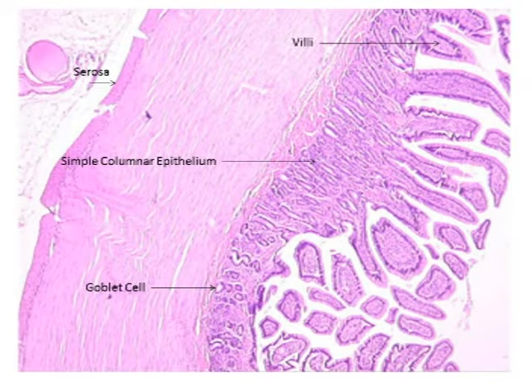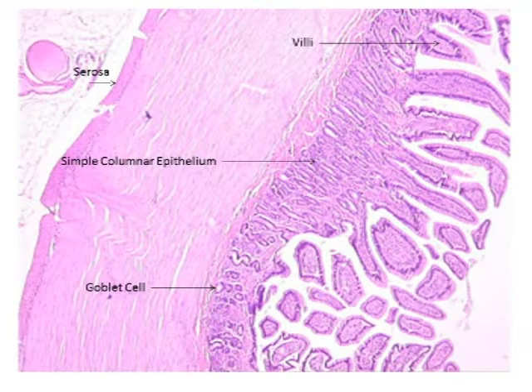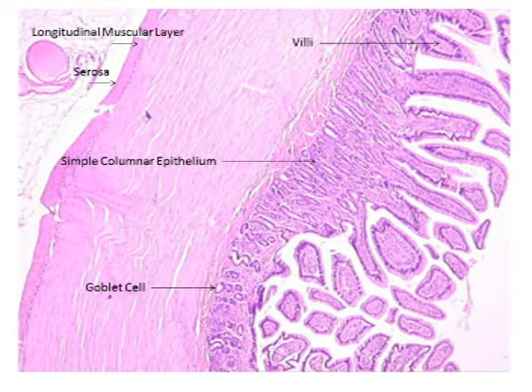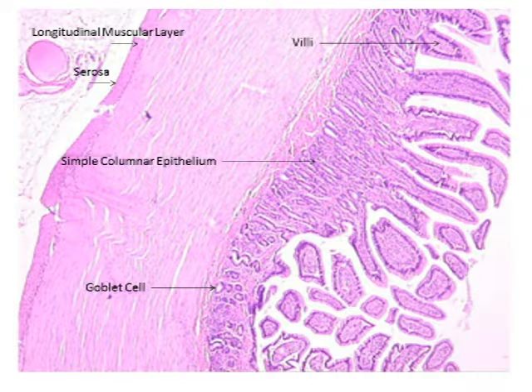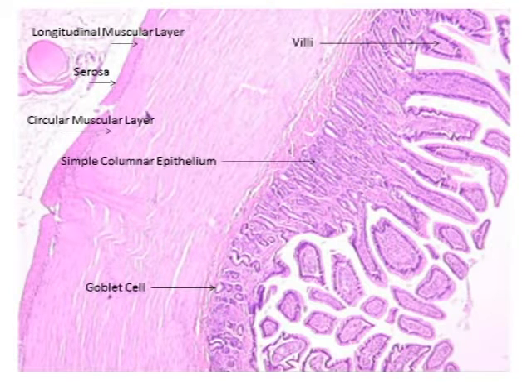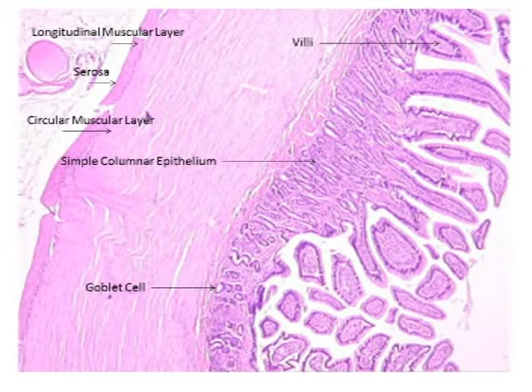You have the serosa again, which is the outside thin layer. Right next to the serosa, you have the longitudinal muscular layer, which is the darker colored one after the serosa. The circular muscular layer is right next to the longitudinal muscular layer and is a little bit lighter and not as compact as the longitudinal muscular layer.